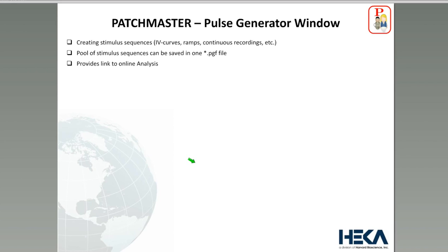The third thing that is important here to note is actually that this pulse generator window provides a link to the online analysis window. And this is something I want to show you in a minute, which is a very powerful tool and function. And these are the three things that you should remember from the PATCHMASTER pulse generator window.